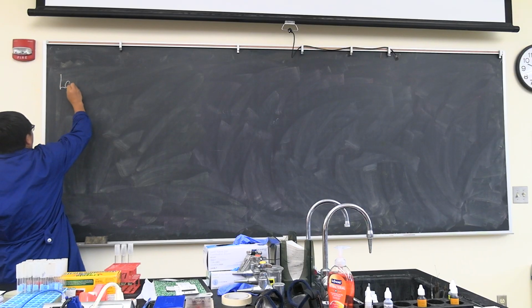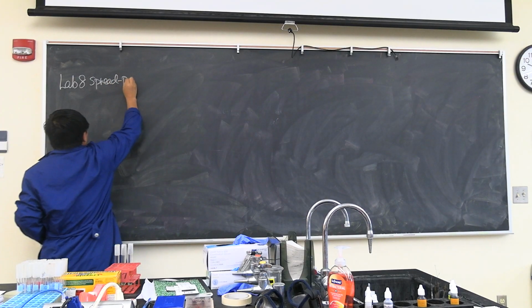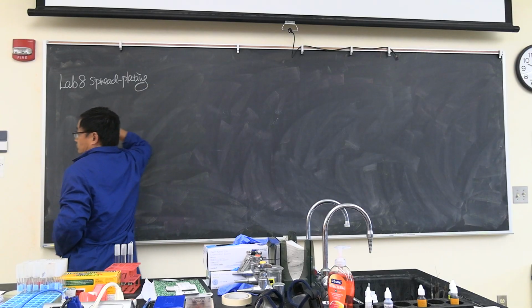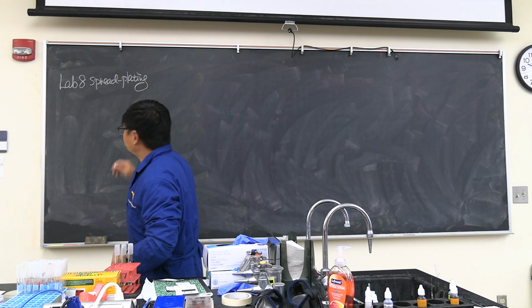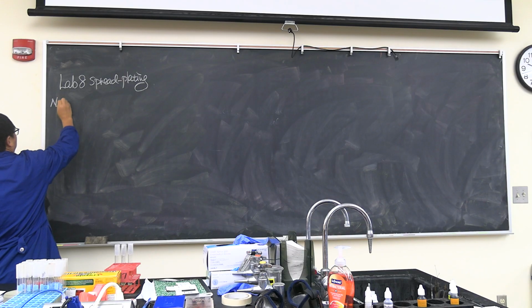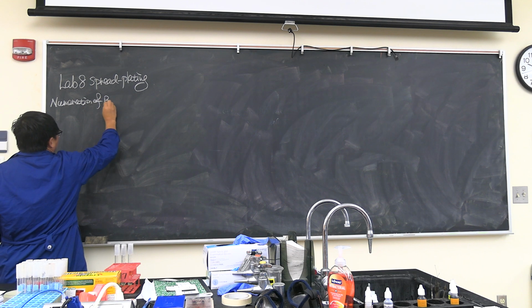So that probably is lab 8, spread plating. Enumeration of bacteria. Okay, we can accept that one. Good morning. So first of all, we start to talk about enumeration of bacteria culture.